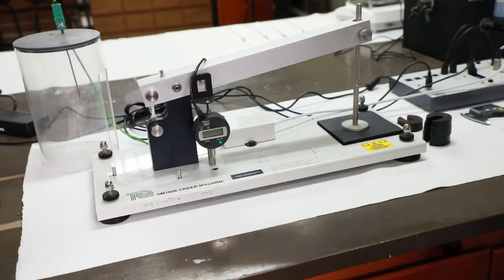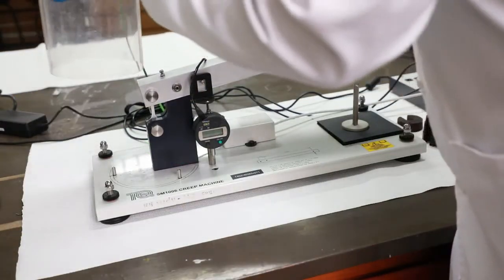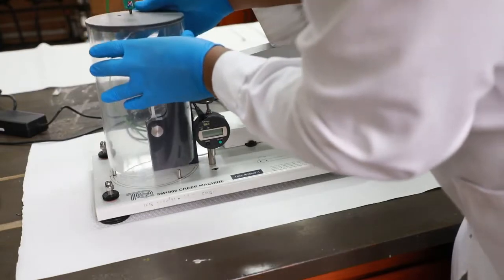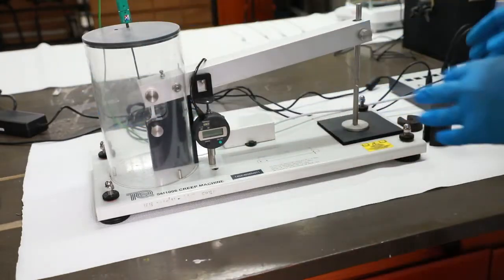Cover the sample with the insulating cover and add 0.6 kg weight to the loading tree while holding the lever arm.